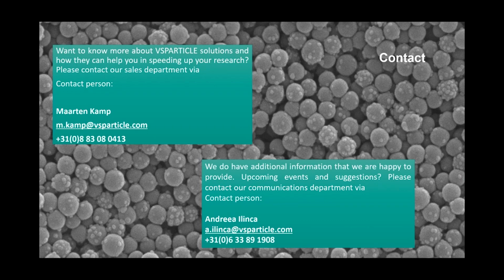I promise. Okay. And a question from an anonymous person who is being mysterious. VSP is able to produce nanoparticles. How is the size of the nanoparticles controlled in this instrument? I think you discussed this in the size selector.